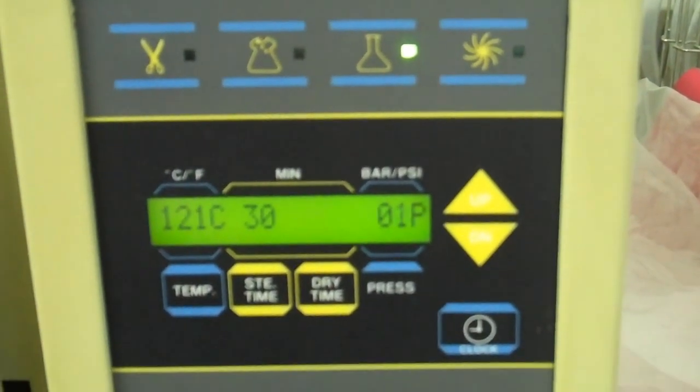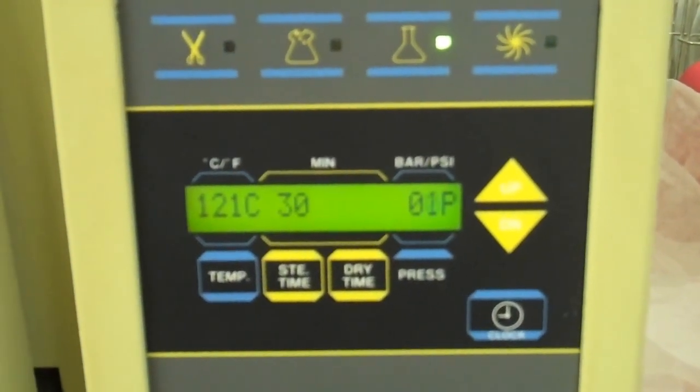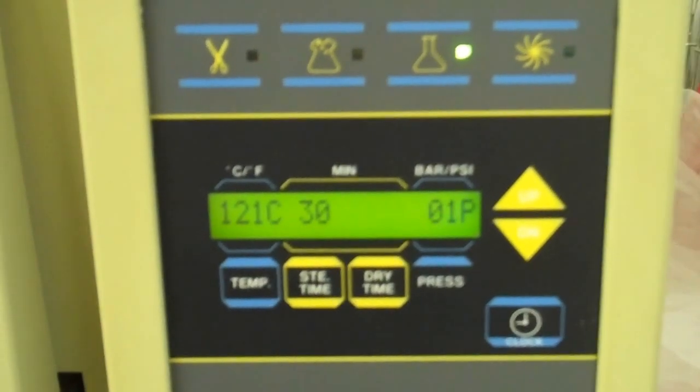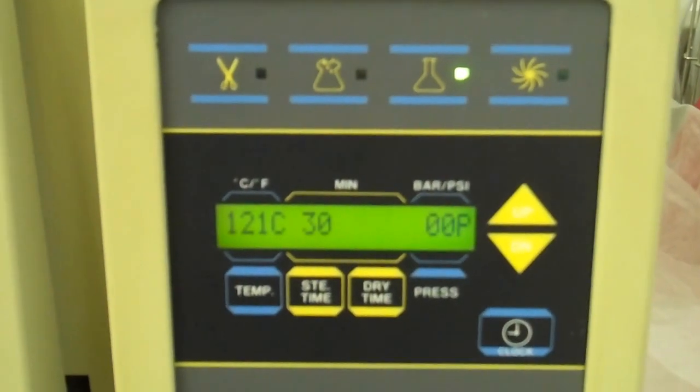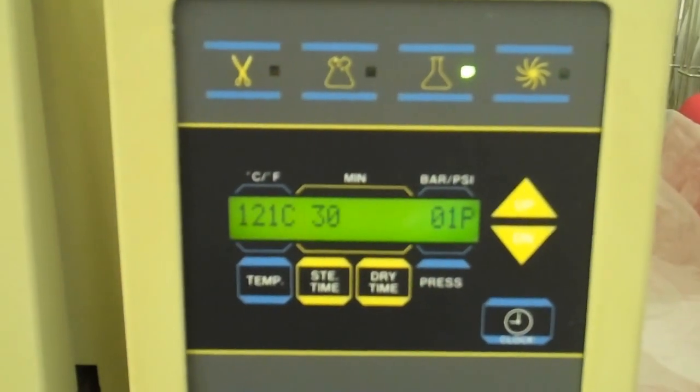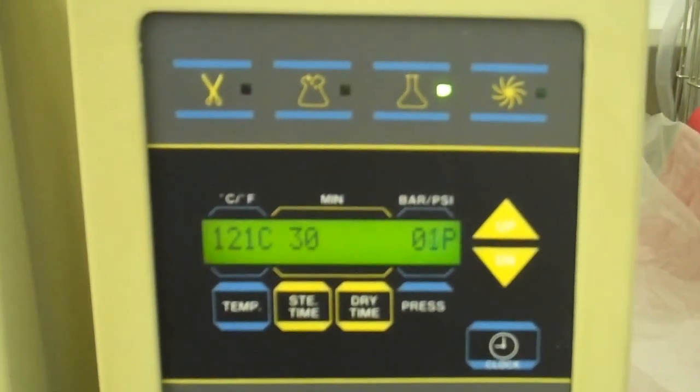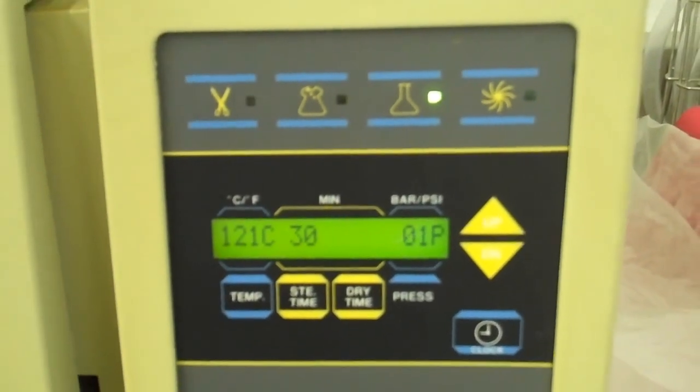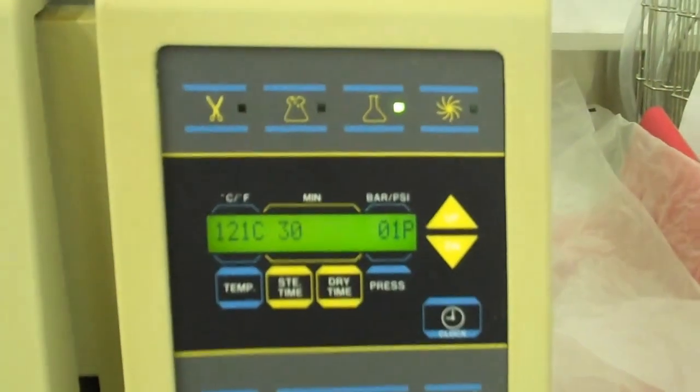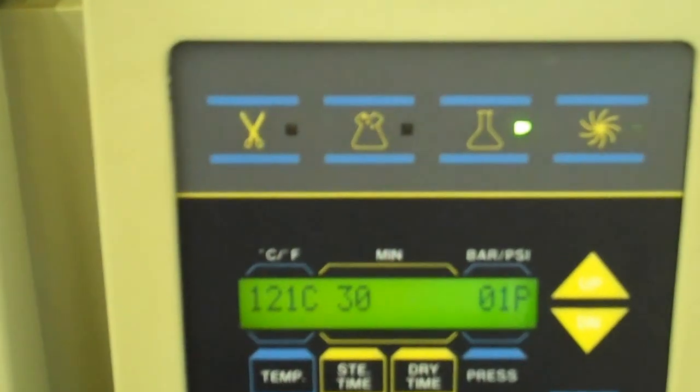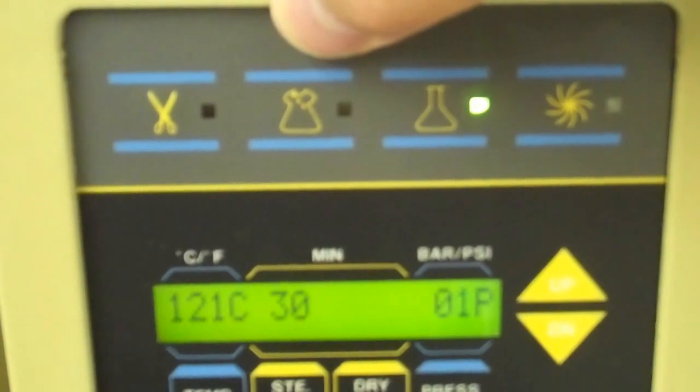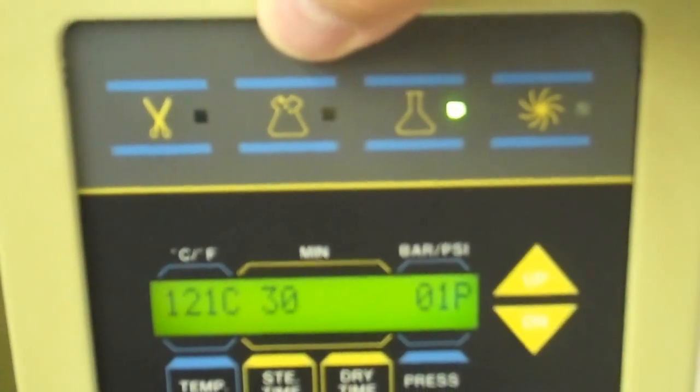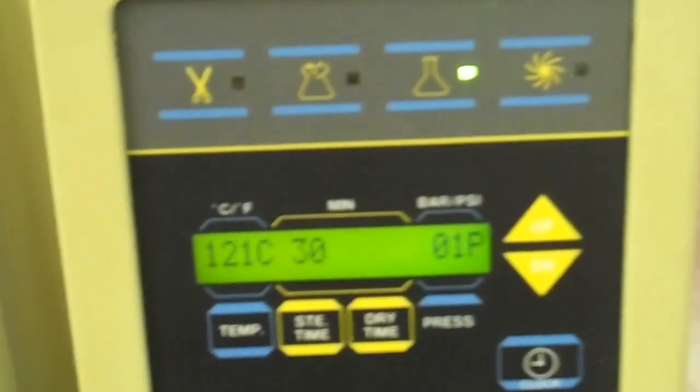Then it will start counting down the 30 minutes, so you're assured that whatever you place in there is going to get cooked for 30 minutes at 121°C at about 15 pounds pressure. This can also be used for just instruments only and it can be used for bio waste.